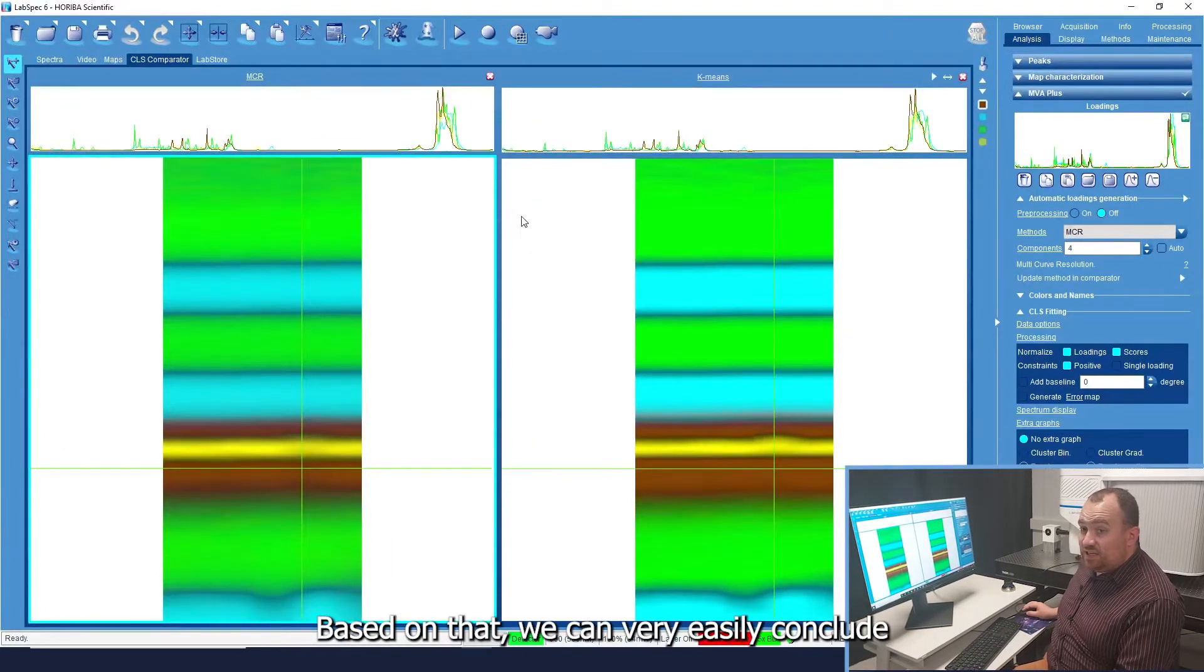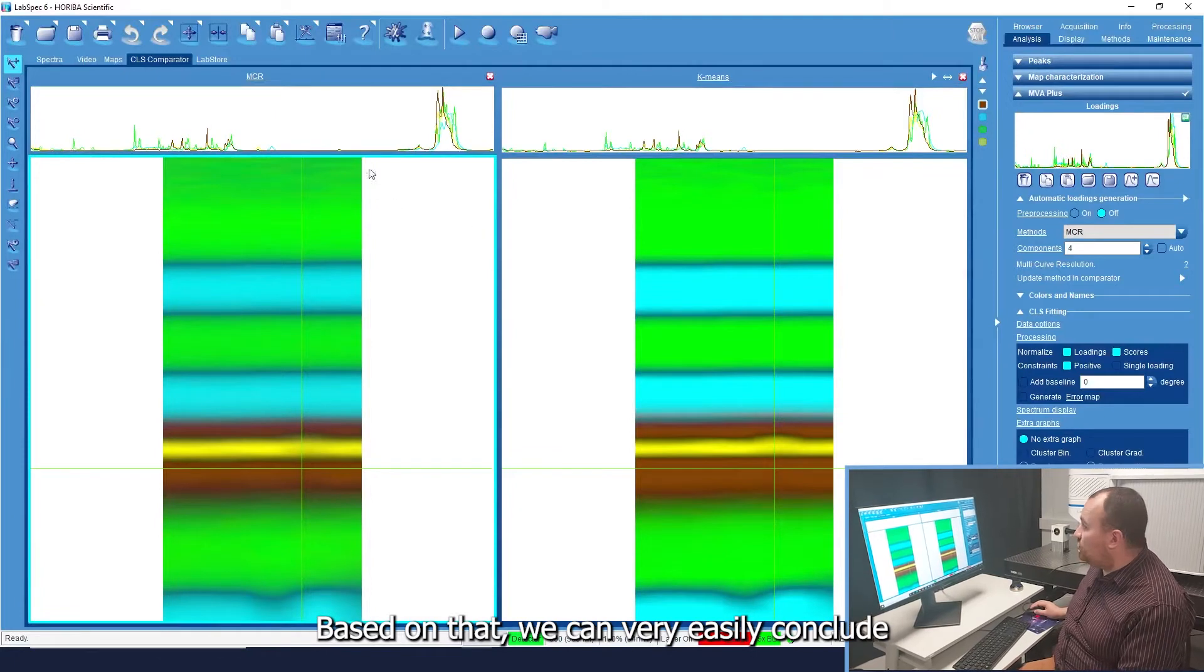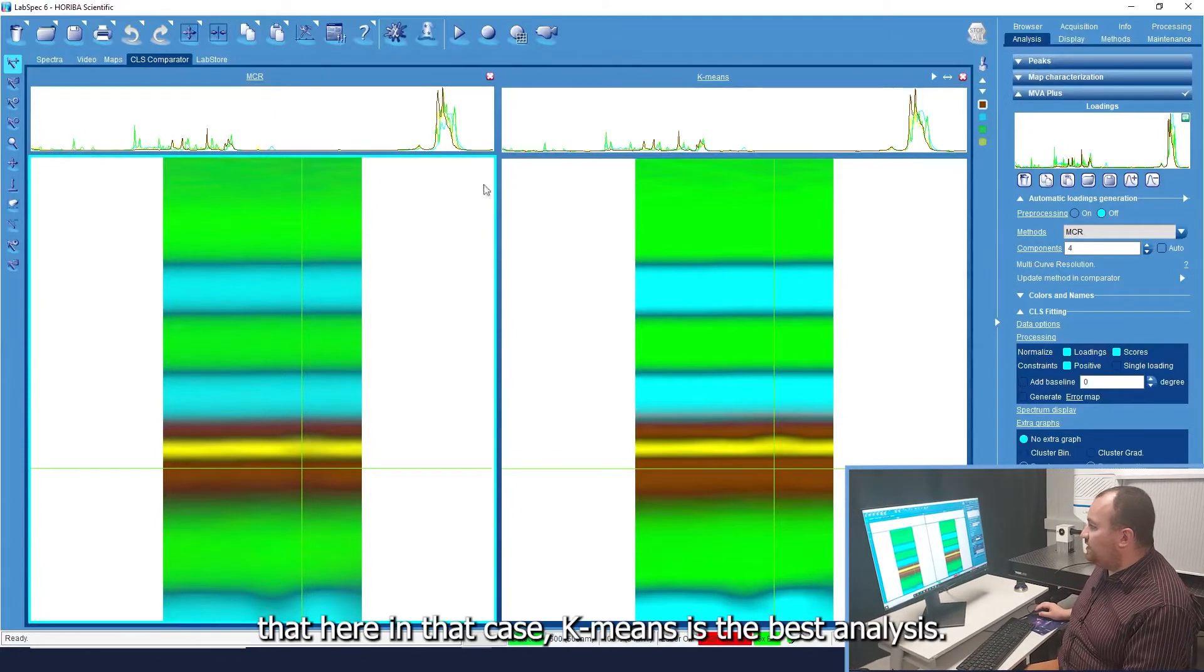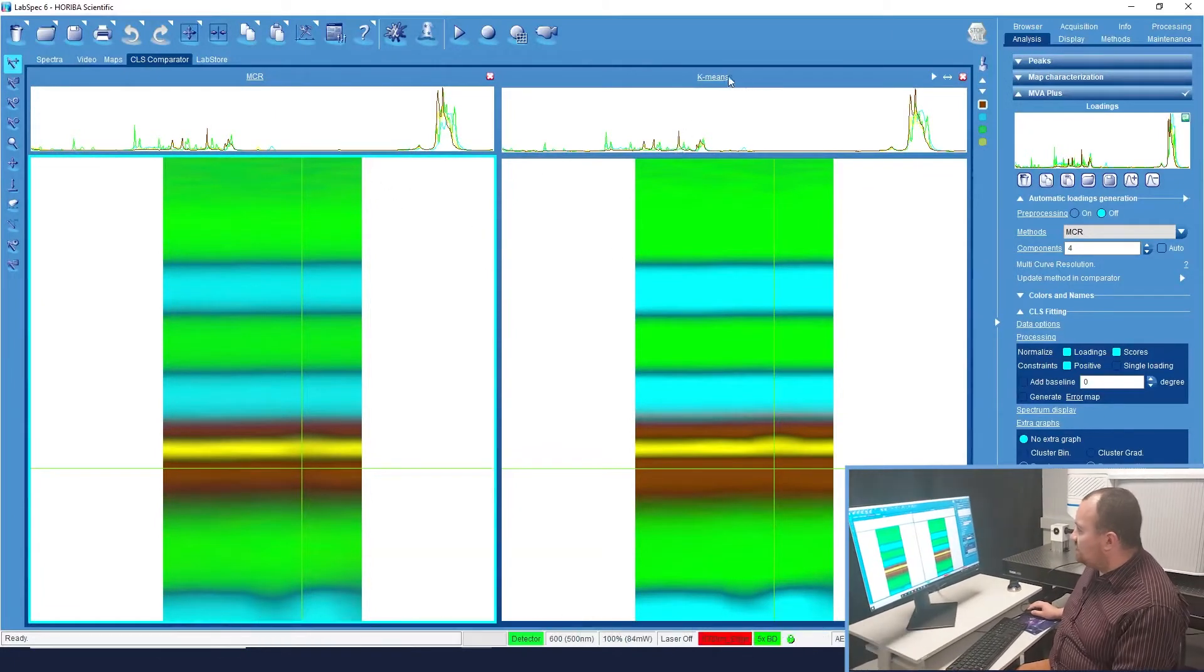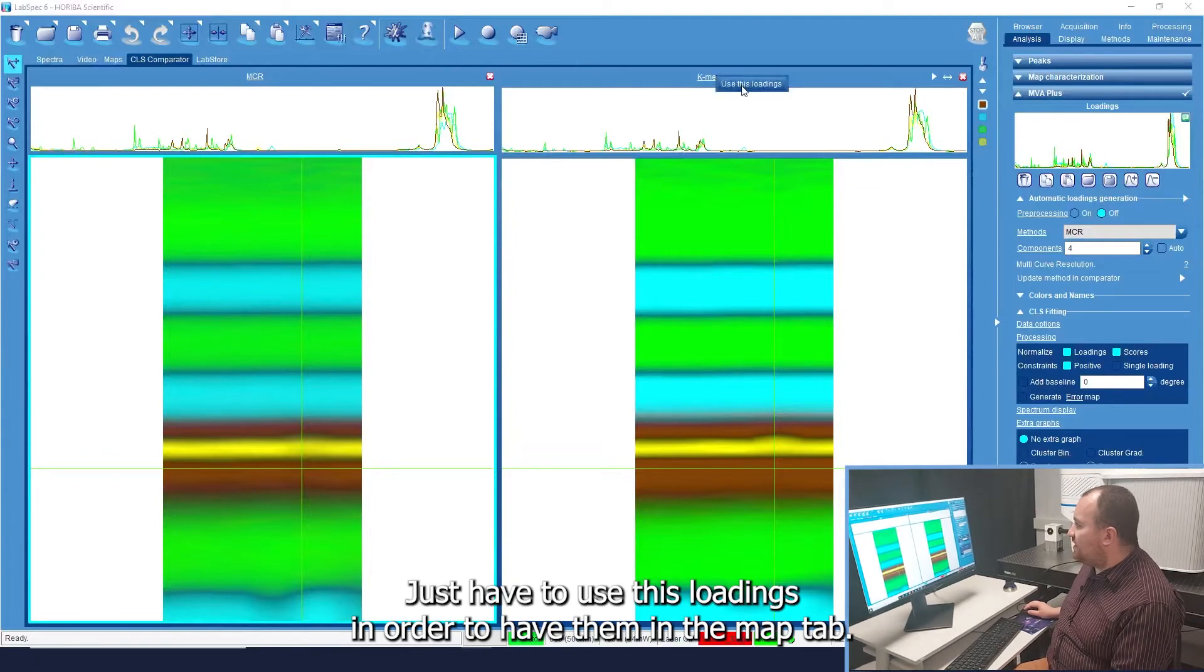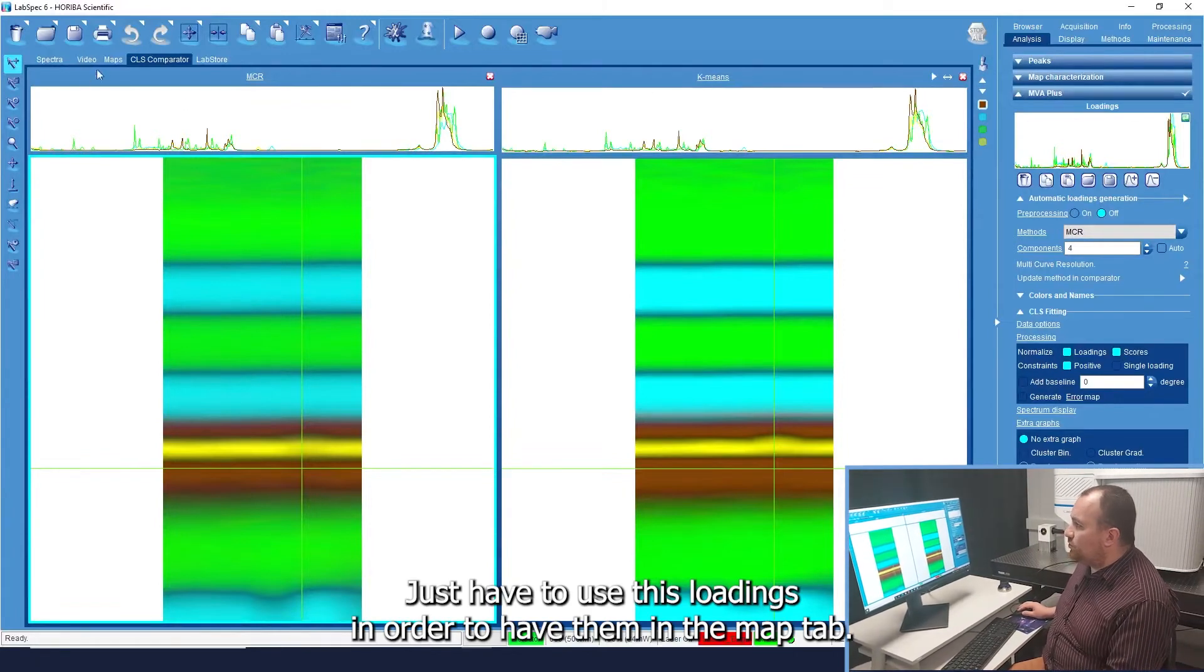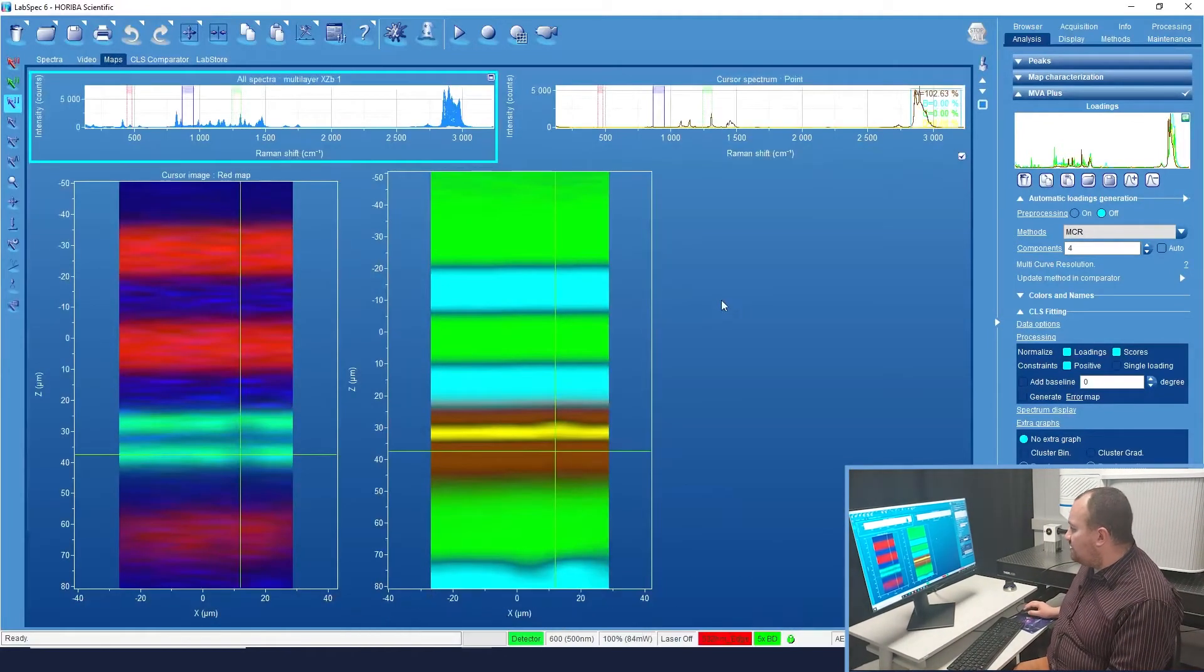Based on that, we can very easily conclude that here in that case K-Means is the best analysis. Just have to use these loadings in order to have them in the map tabs.